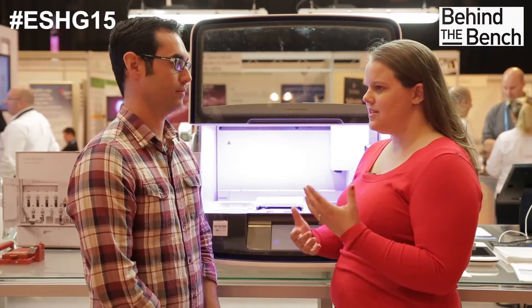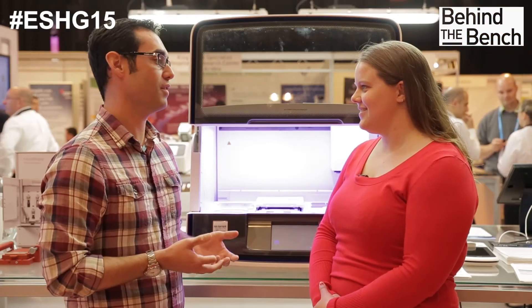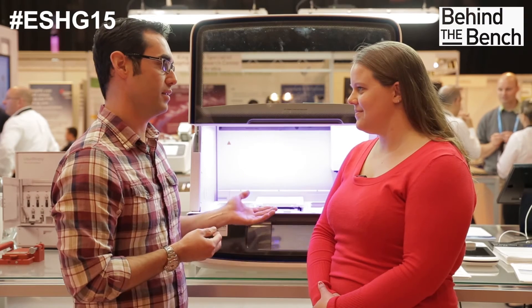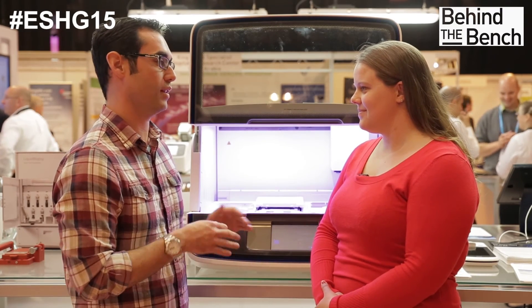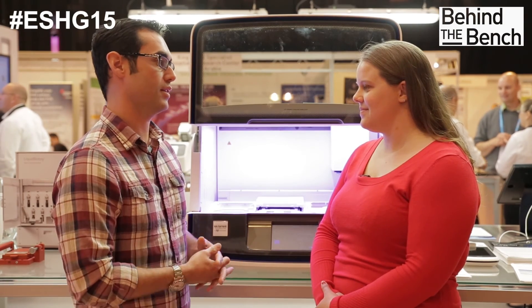Can you tell me, is there still a need for a library quantitation step when using the ION Chef? Actually, no, there isn't. What we've done is we've enabled ion equalizer chemistry directly into this, so you get a normalized set of libraries coming out that can go directly into templating. During our development efforts, we've been able to look at the equalizer library balance and we've seen less than 10% deviation between samples, giving us really consistent library quality and quantity across eight samples, both intra and inter runs.